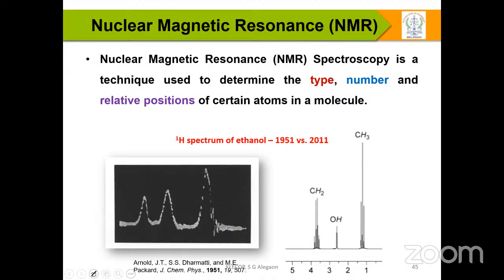Nuclear magnetic resonance, or NMR, plays an important role nowadays in medicine and health. Basically, it was invented by a physicist, developed by chemists, and enjoyed by medical people. This one instrument has received five or more Nobel Prizes, starting with physics, then chemistry, and medicine. One instrument spanning interdisciplinary areas in the Nobel Prize, that is NMR.